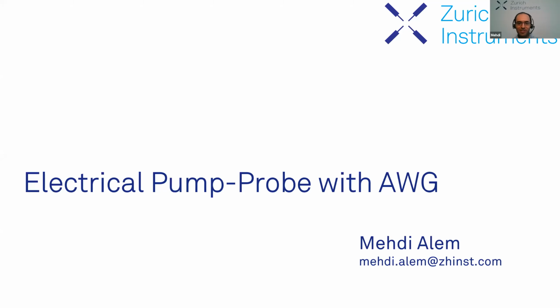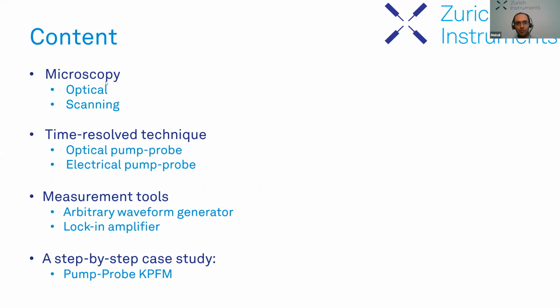Thank you very much, Magdalena, for this kind introduction, and welcome everybody to this tutorial session. I would like to thank Valentin for his interesting talk on KPFM, and let's start where he actually finished his talk, which was actually a pump probe approach for KPFM system. So I would go quickly through microscopy, especially optical and scanning microscopy. Then we take a look at time resolved technique.